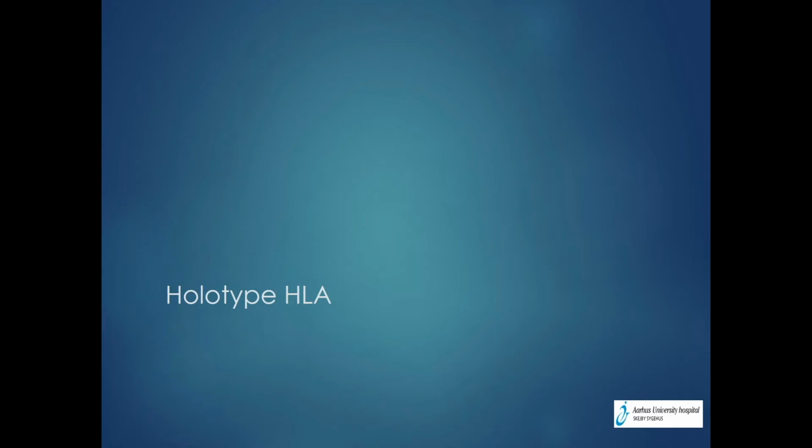And since then, we've now been in routine for a year, so now we're heading for automation. I'll come to why, because you can say, how many samples do we run? We run about 24 samples a week. It's not a huge amount, but I still think there are really, really good reasons to automate.